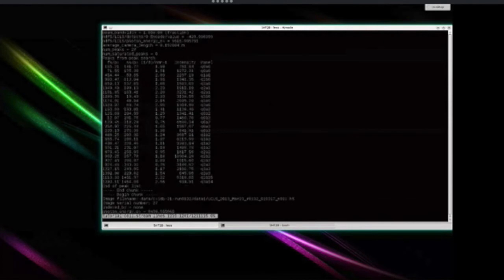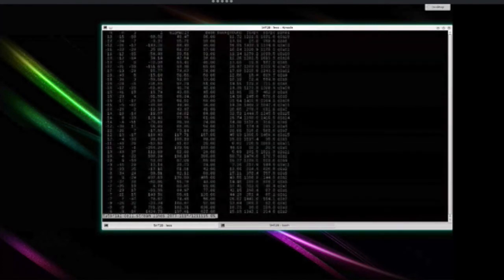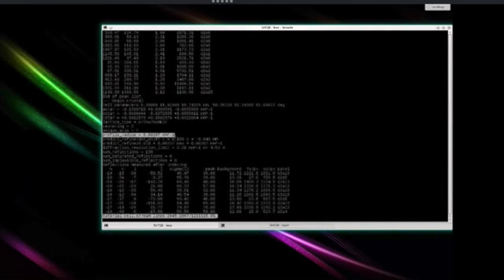So let's find an index pattern. This profile radius here is the size that a reflection has to be in reciprocal space before it touches the Ewald sphere. It's the maximum distance away from the Bragg condition that the Ewald sphere can be while still causing diffraction.